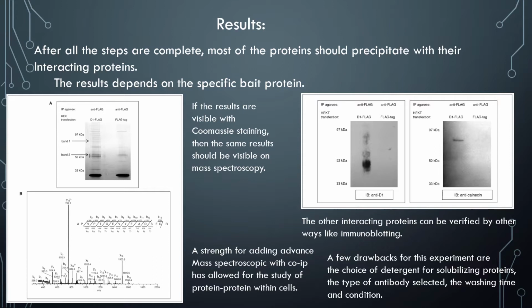Some of the strengths of using this experiment is that adding the mass spectrometry with the co-IP has allowed for the study of protein-protein interactions within the cells.